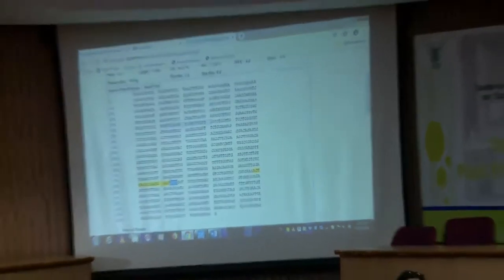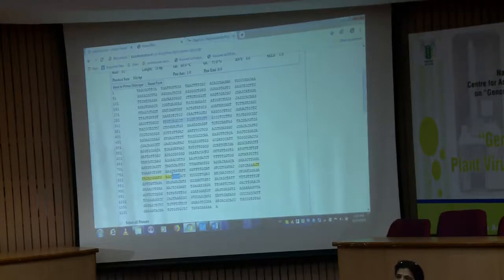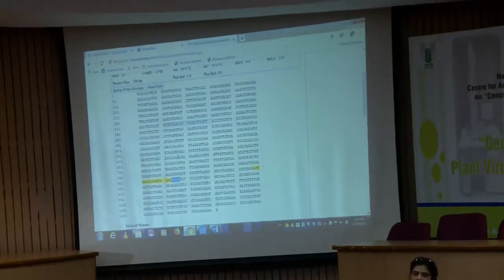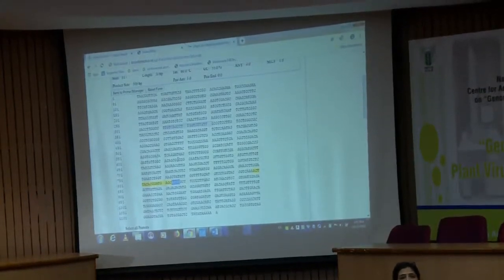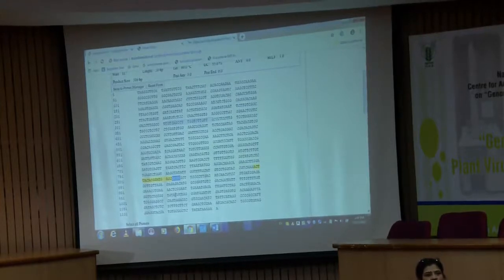So, it is making it ready made for us that okay, you pick the sequence and send it for synthesis, correct. Any confusion? Please take care that one primer is always the reverse complement of your sequence. Do not give it like that, like the forward primer is this one, reverse is not this one, reverse is the reverse complement of this one, okay. Otherwise, what will happen? The primer will bind at your sequence anyway, but it will amplify the region beyond that, like it will start amplifying the region from here, which you do not want, okay.